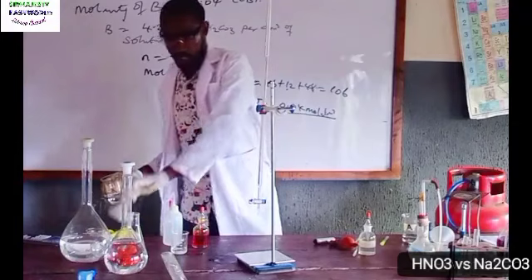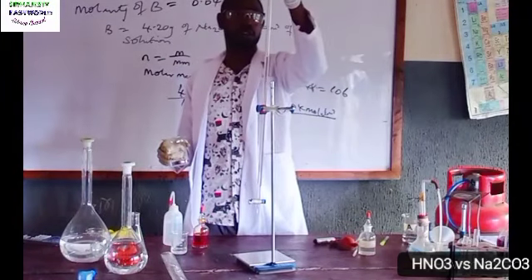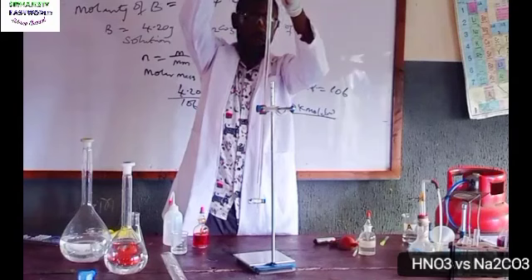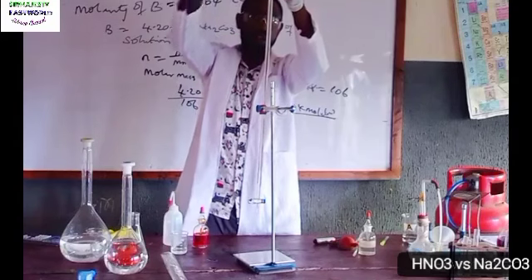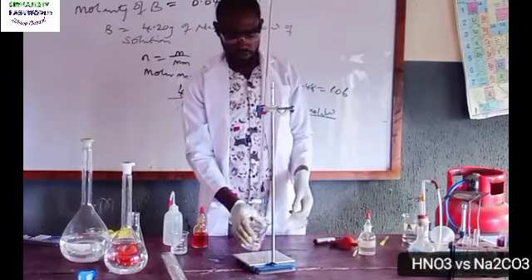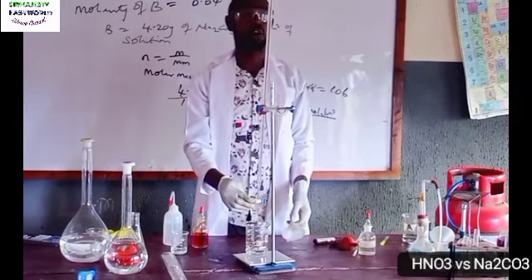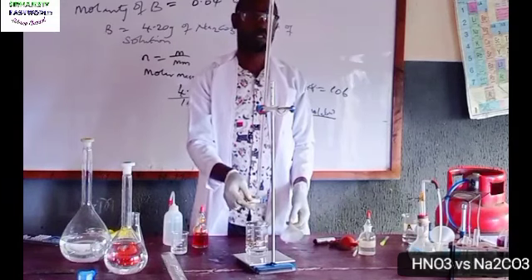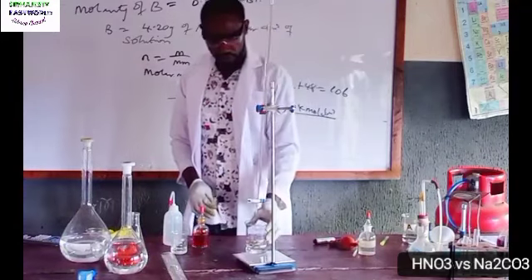To avoid unnecessary mistakes in calculation, you need to fill back just to get to 0. Make your initial 0. You can continue from that 13.5 as your initial. I've filled to 0.